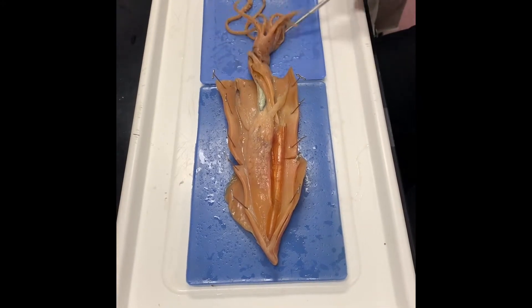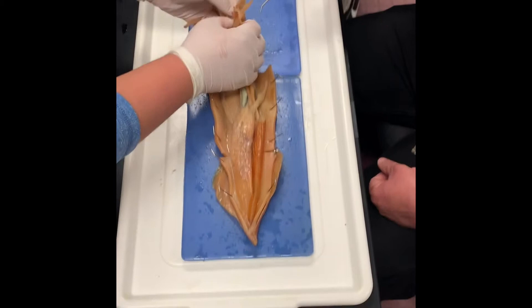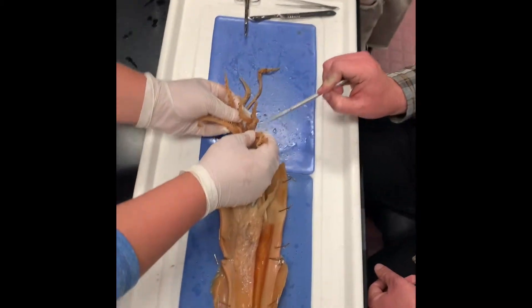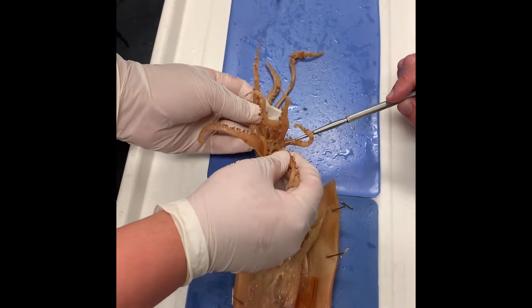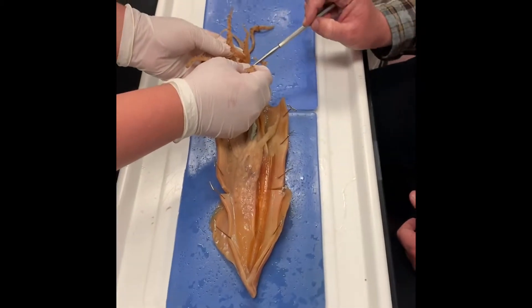Pull the arms open so everybody can see the beak inside of there. You see that? This is the beak right in here. And if we were to open the beak — which we're not going to be able to do — that's where you'd find the radula inside. So it's the radula surrounded by the beak, surrounded by arms and tentacles.